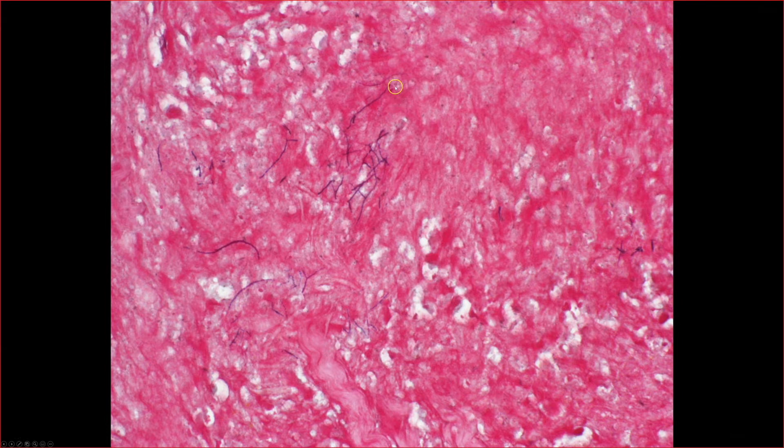And then here, this was the gram stain. Look at these long, long filamentous gram-positive rods with a kind of almost beaded appearance — that has been described as one of the features you see. And they can also be weakly acid-fast as well.